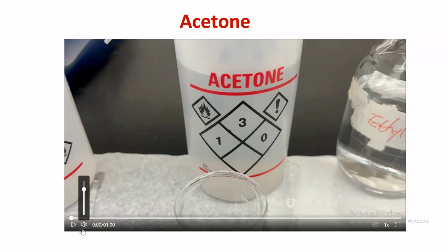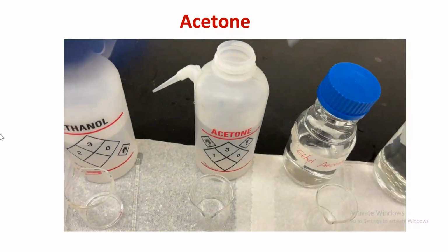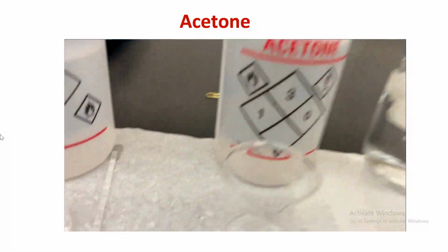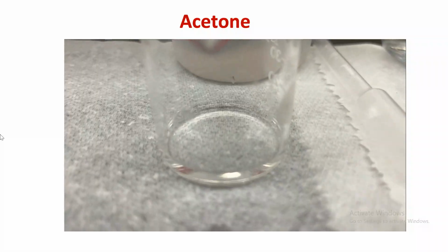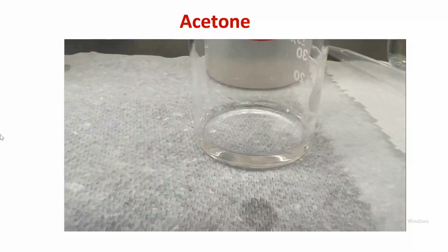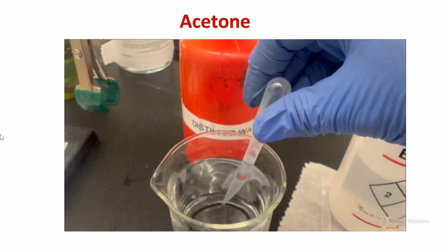The second liquid we have is acetone. Let's see how acetone behaves. All right, we're adding some acetone again in the beaker, and then we'll be adding distilled water, which is water that is pure.